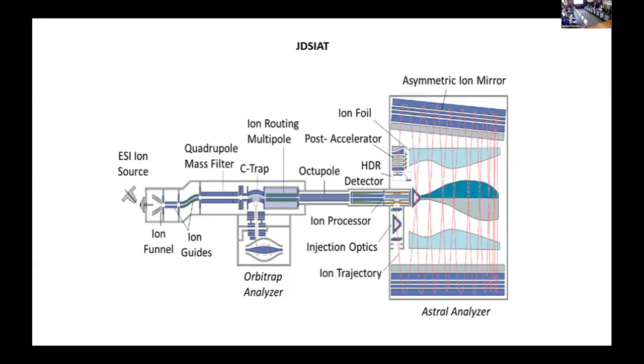Just don't say it's a TOF. So it's a TOF, but it's a really, really nice TOF, right? It's a kind of nonlinear TOF, a very, very clever design to get the ions to move. I guess we'll probably hear about this at lunch.